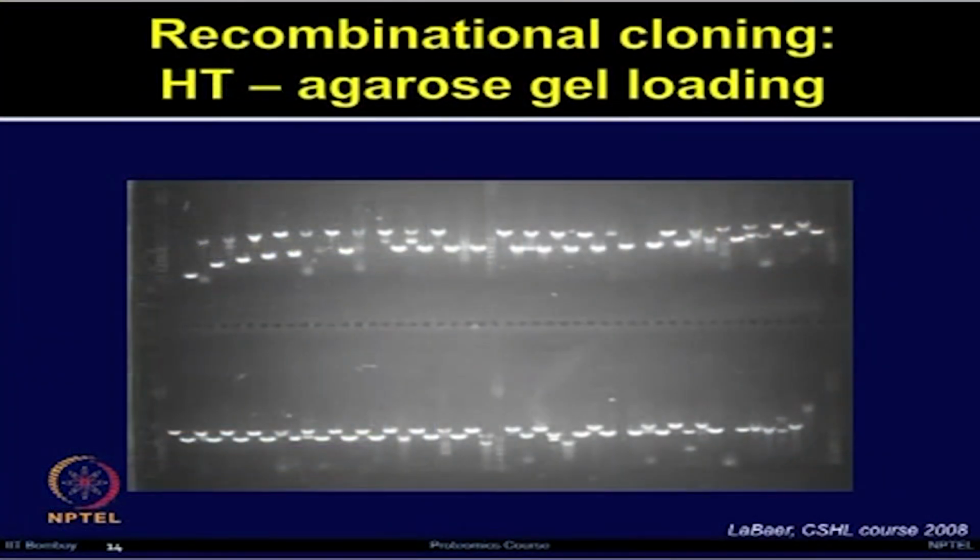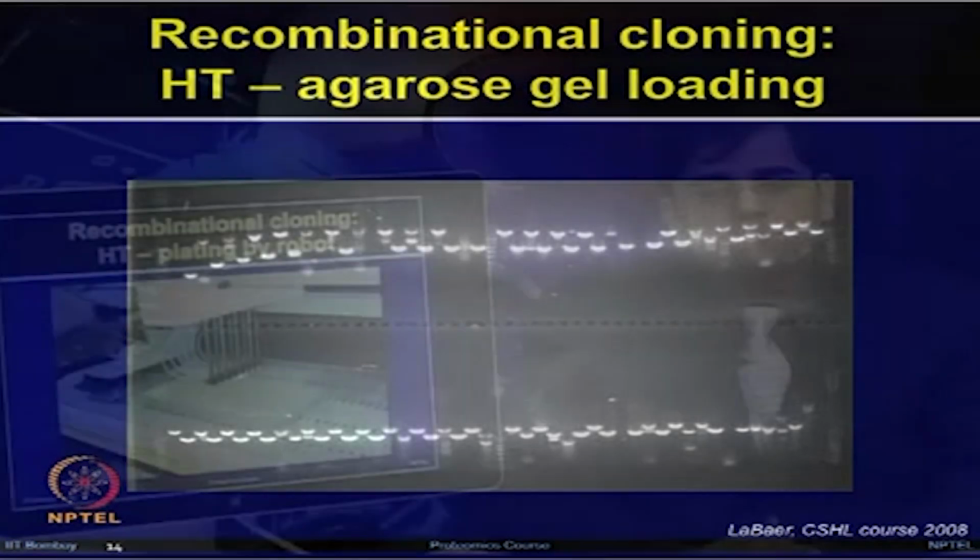In the gel here you can see the sawtooth pattern for loading the gels, which makes the band size identification easier and avoids contamination from the neighboring lanes. By loading in the alternate way, you are avoiding contamination which can go to the neighboring wells due to overflow of the sample, and also you can easily identify your sample and the molecular weight.